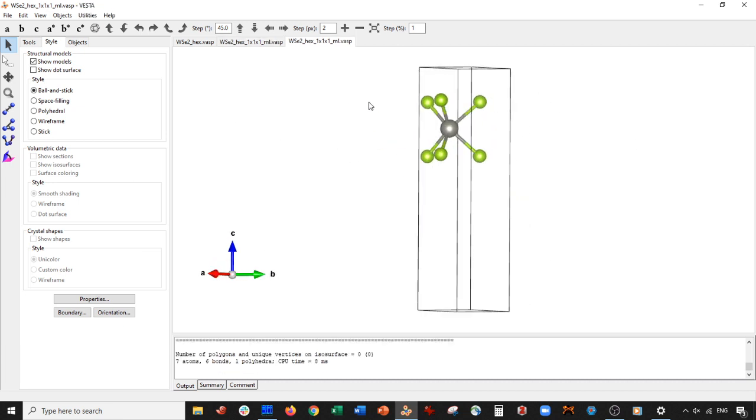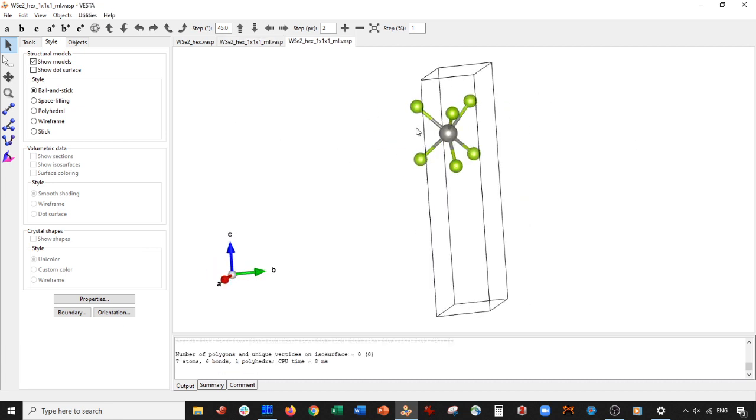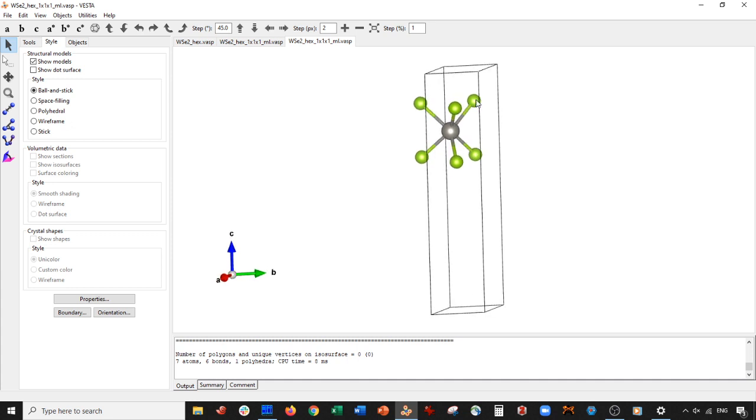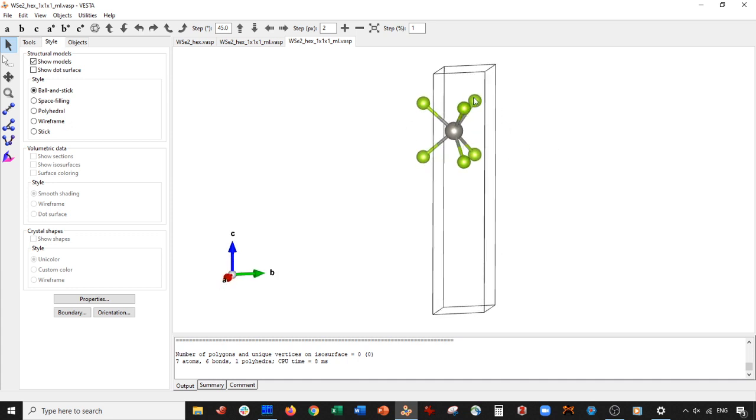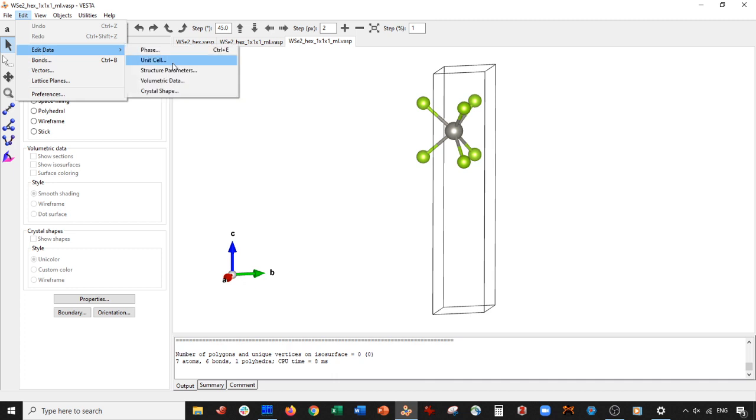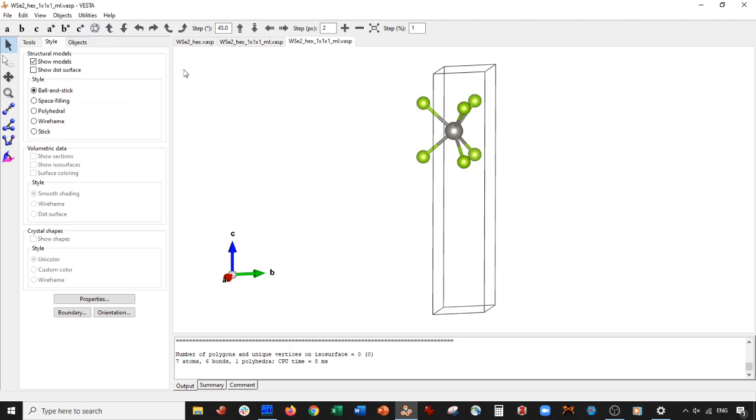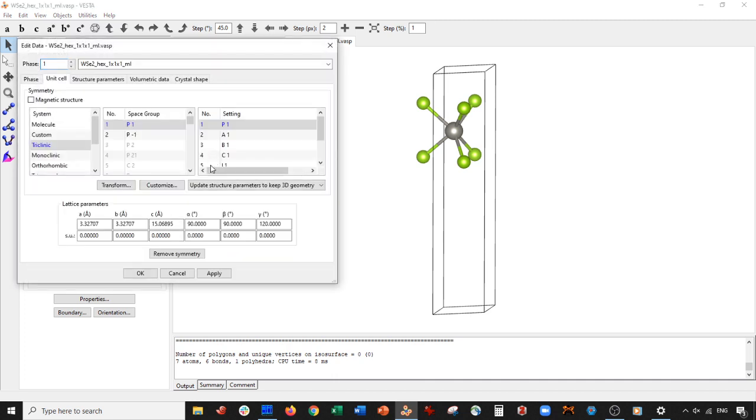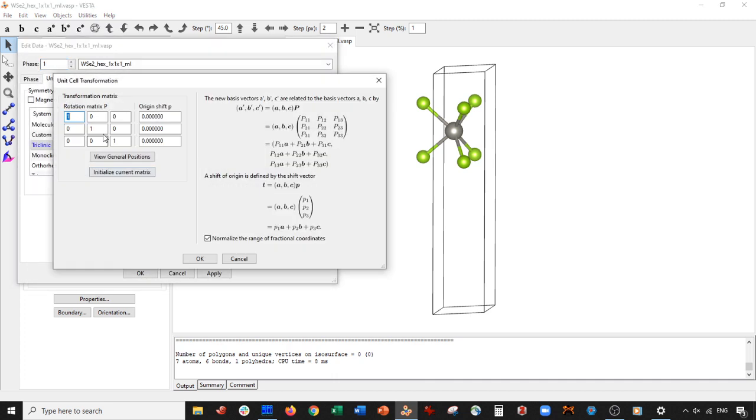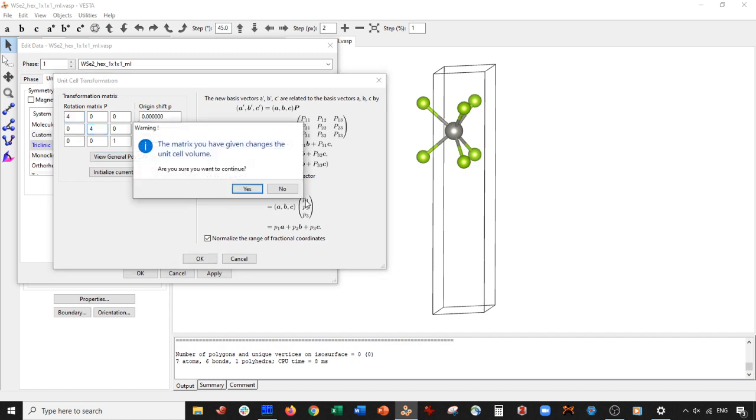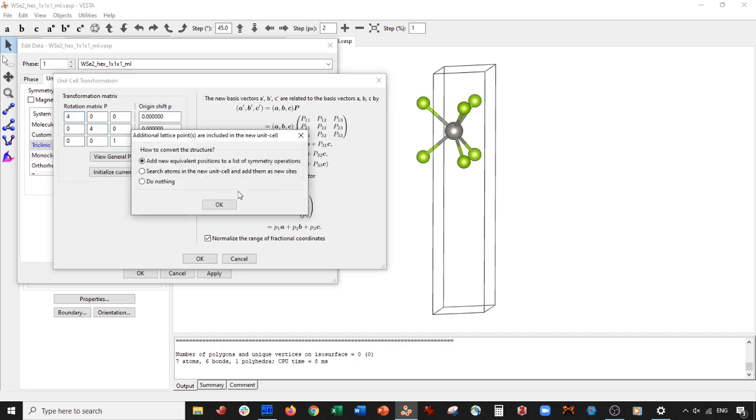And then what you do is you notice if you want to expand the unit cells themselves, the unit cell itself, you can go to edit, edit data, unit cell, transform. And then maybe you could do like four by four. Go ahead and press okay. Yes. And now this is your new unit cell here.